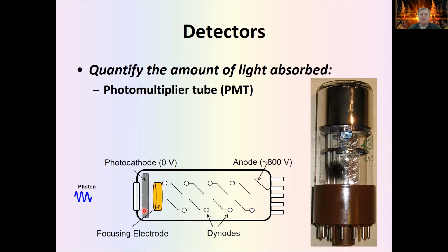And what's going to happen is as the electrons collide with these different plates, since they're colliding with a lot of energy, they're going to be releasing more electrons than they start with. So this first collision releases some electrons. I'll back up this animation again. Releases some electrons, and each subsequent impact releases more and more electrons. And so this is a cascading effect where we just multiply the number of electrons we have by some factor each time we hit a plate.